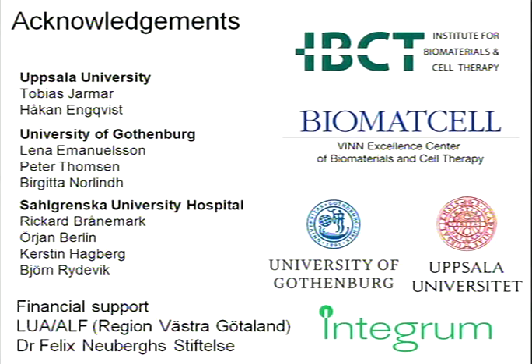So there might be a difference in the interface between different locations in the body, but it's also dependent on the techniques, how to analyze. So it's dual, I would say. And we need to look at more retrieved implants to find answers.